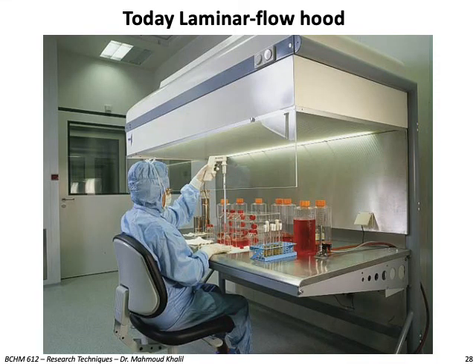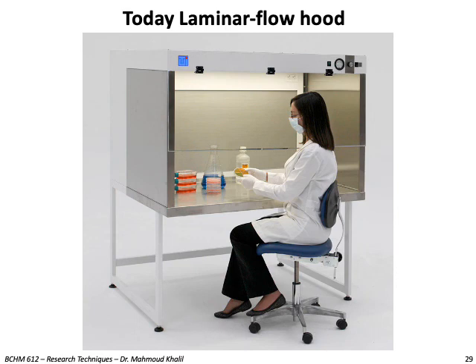And you can see here today's laminar flow hood, how it's organized and how big it is. Another picture of today's laminar hood.